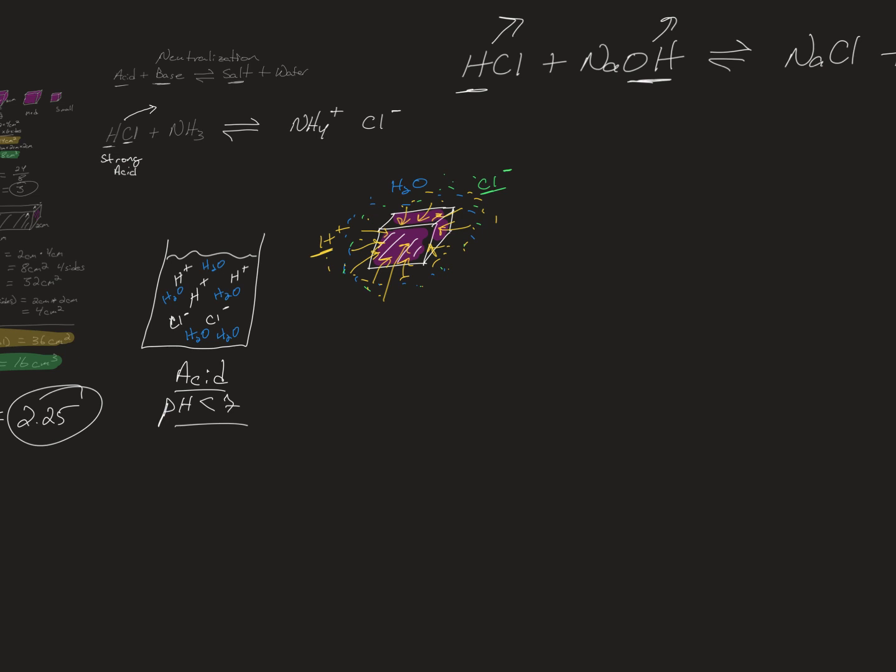Hopefully we can at least start to see it, even if you can't measure time. You're going to have your chart that you've already filled out. I just showed you how to do the calculations. You're going to measure time. As soon as you put the cubes in, you start a stopwatch. As soon as it changes color completely, you stop the stopwatch.